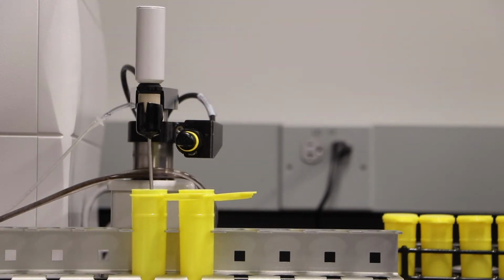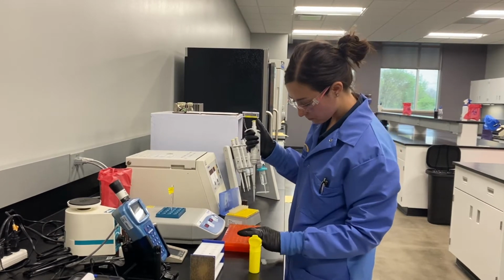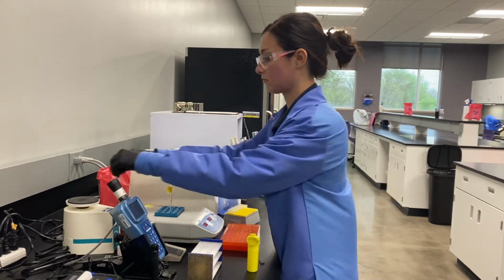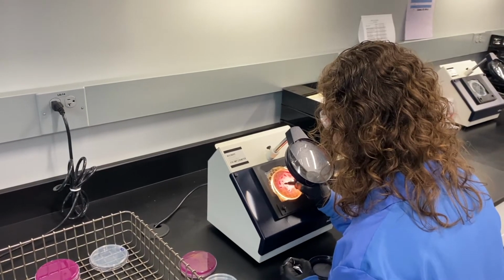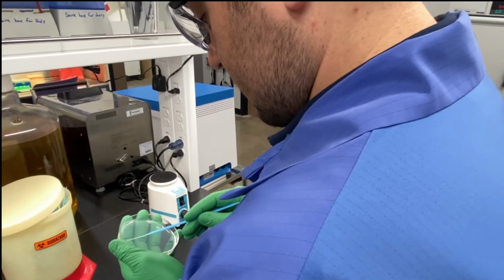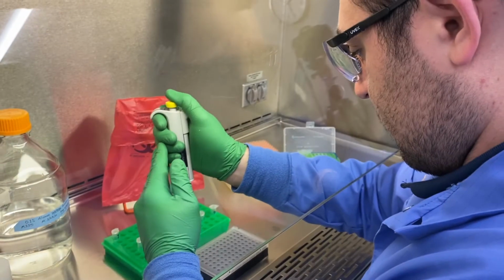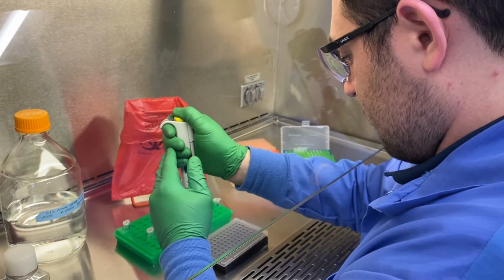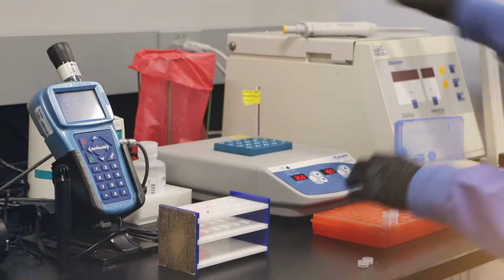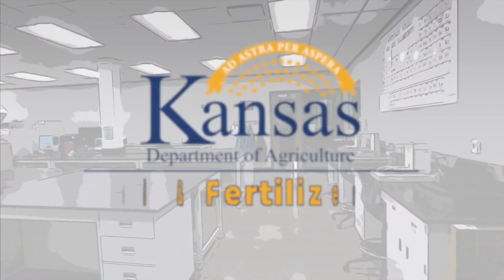Along with typical bacteriological analyses, our microbiologists perform somatic cell counts on milk samples and also test for an enzyme that indicates proper pasteurization. We run regular chemical and microbiological analyses on meat products, and we examine food samples as part of investigations regarding foodborne disease complaints. Our microbiology lab work helps to verify that food processing and manufacturing processes are effective at preventing foodborne disease.